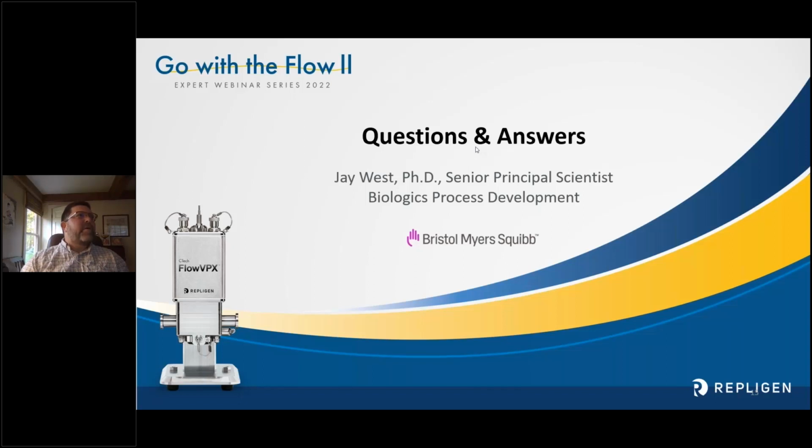It's probably not in upstream, because for biologics, especially monoclonal antibodies, you have the cellular material and the extracellular material, the media, and of course the monoclonal antibodies are secreted in the media. So typically, if you're measuring CQAs, which is what this instrument can do, of course, it's like A280, or more correctly, UV-Vis based.